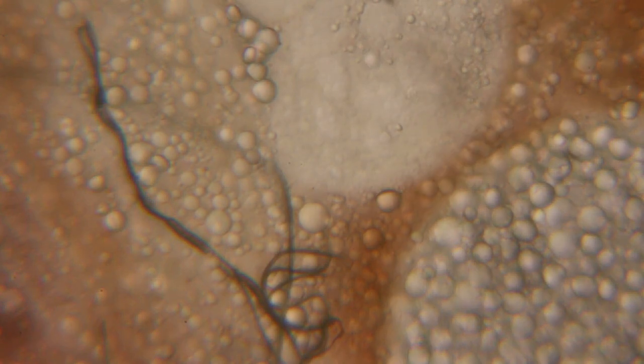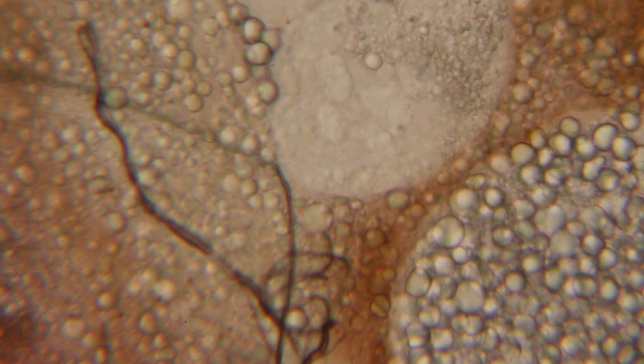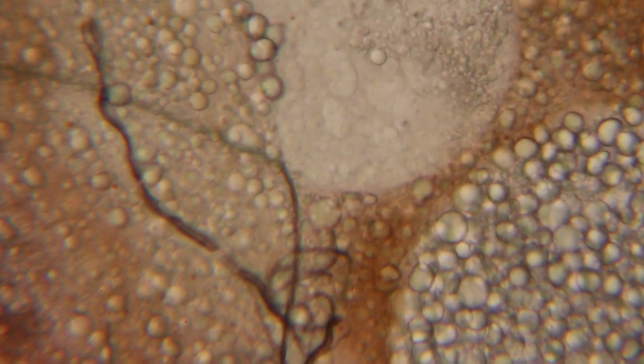Here we have, again, my blood cells. What I think is happening here is that the fluid on the outside is different from the plasma in my bloodstream, and we're getting a hypotonic situation where the water wants to rush into the cells, which expand and ultimately will burst in many cases. So you might even see in some of these images the cells actually bursting because they're becoming too big. That would be a hypotonic scenario versus hypertonic. Isotonic is where you have an equality between the inside and outside of the cell wall.